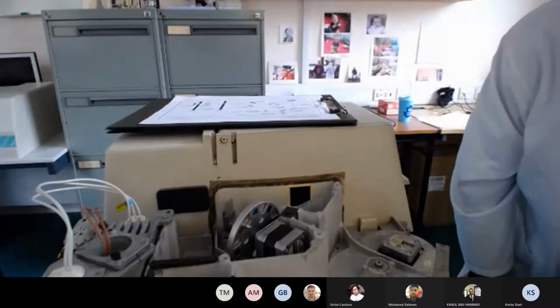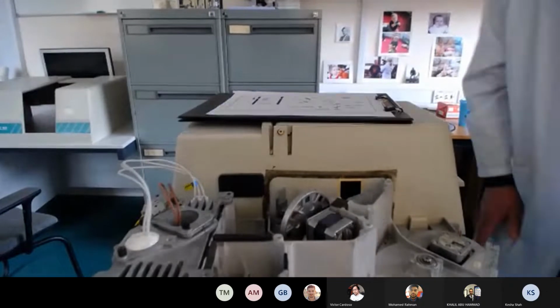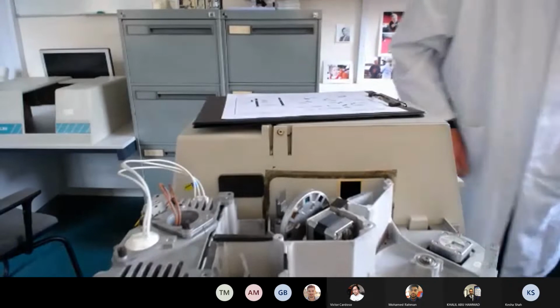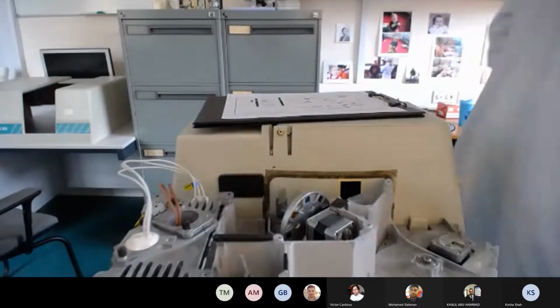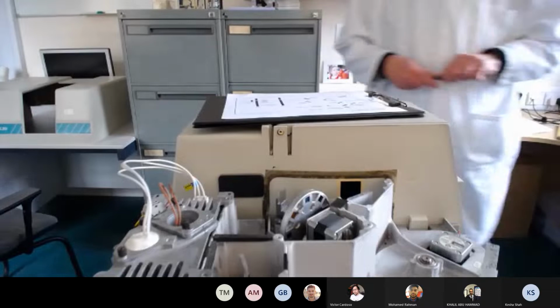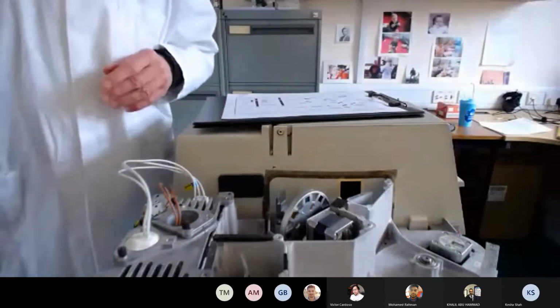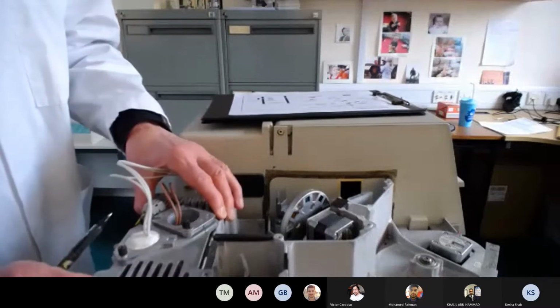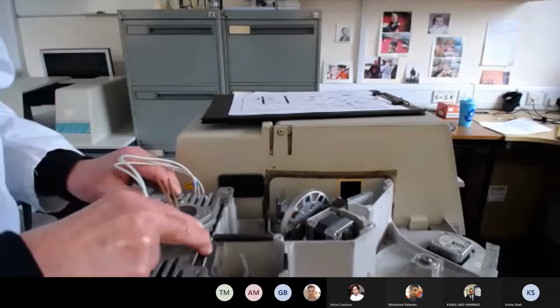Yeah. Okay. Right. Just turn that a bit so you get the light source. So what you basically have is, let's get a pen. Right, so I'll just take this out here.